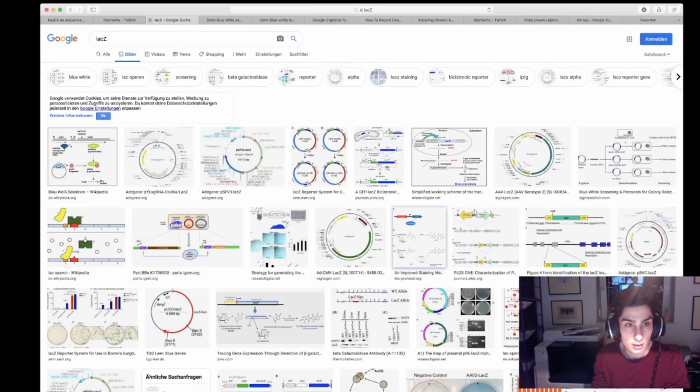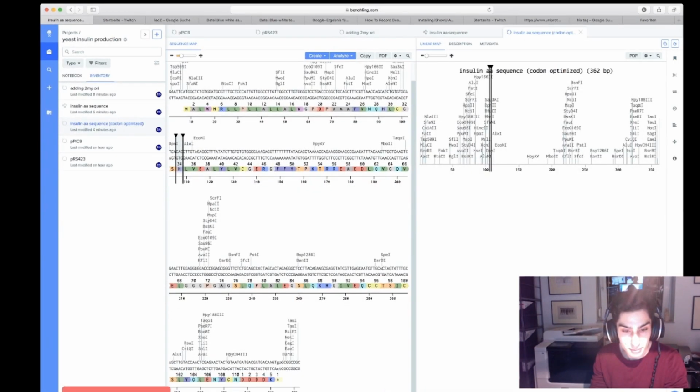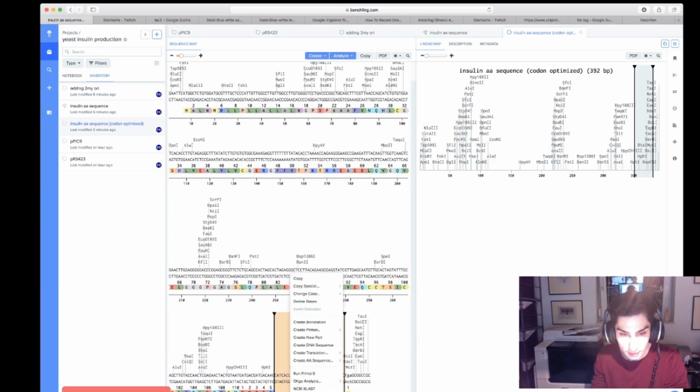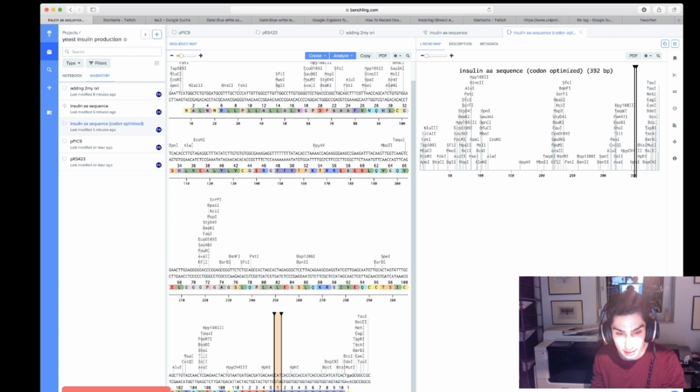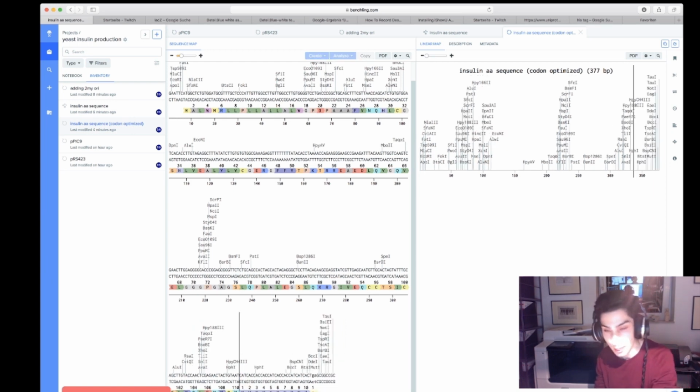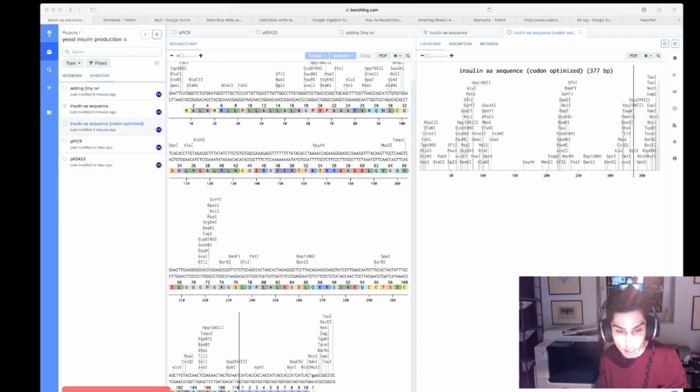So what we basically will add now is the 10 His tag, which is like the amino acid histidine, but for the end of the sequence, maybe we should use the backward cleavage site, because we want to cut in the different direction than forward. Okay. So K and then 4 times the D.